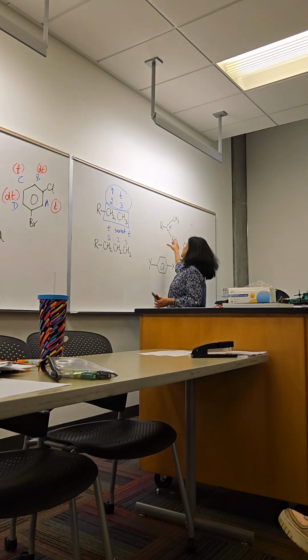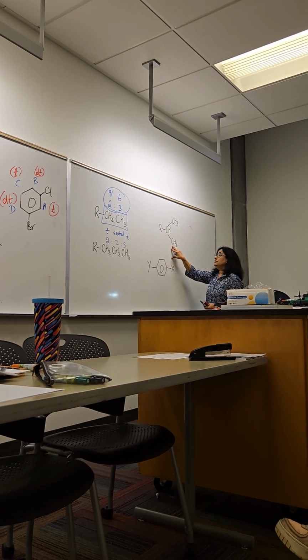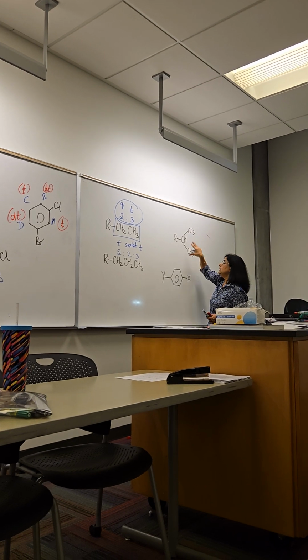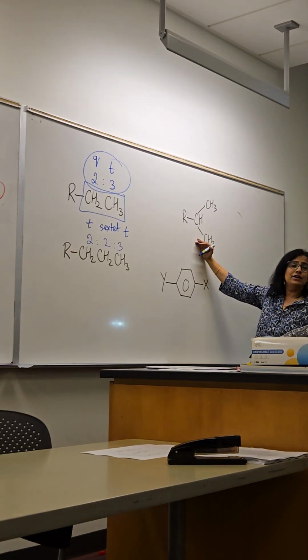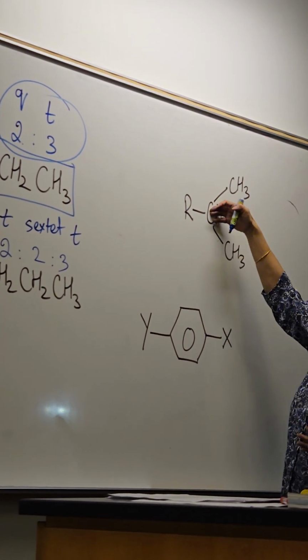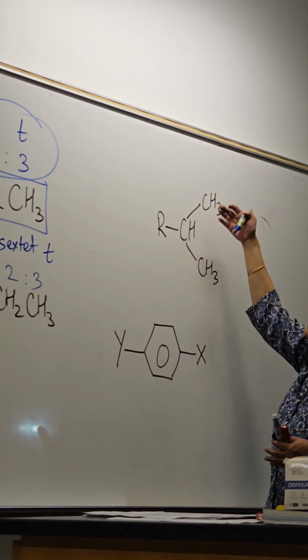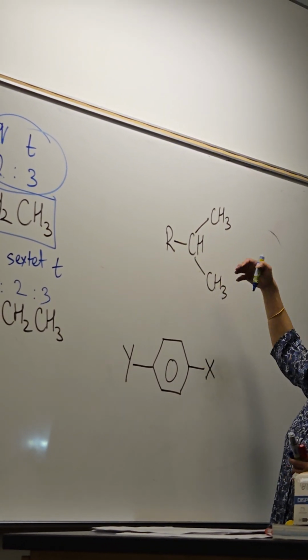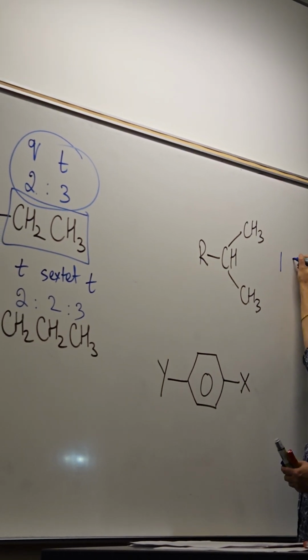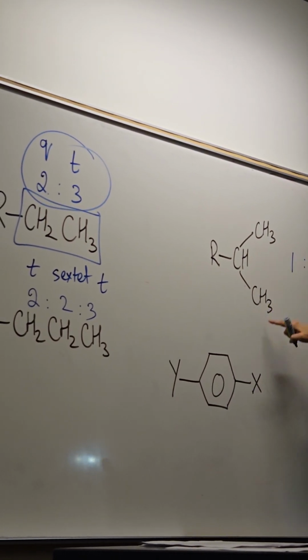And this is very interesting, I love this one. How many signals for this piece only, just for the isopropyl group? 2 signals. What do you expect the integrations to be? 1 and 6. 1 for this and 6 for that.